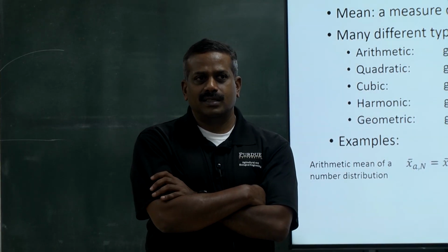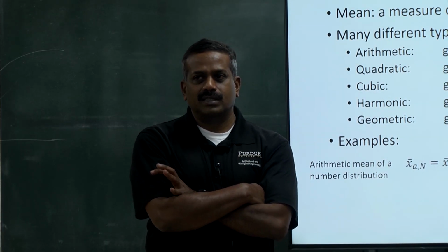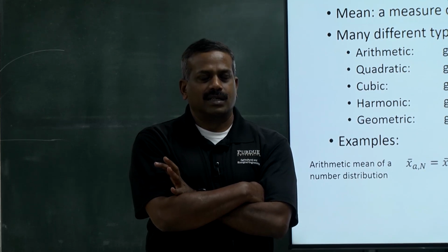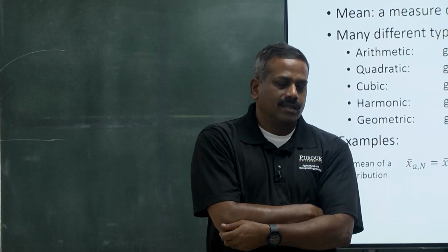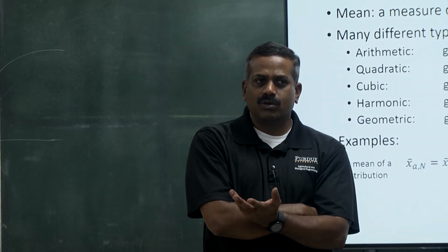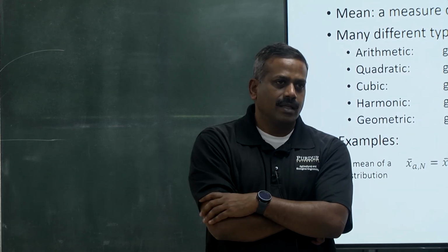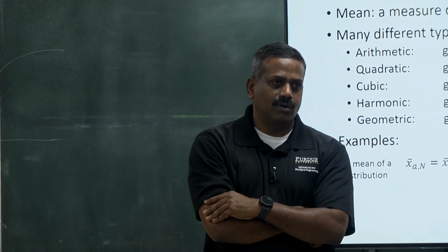Shear cell. Ring shear tester. Again, we will talk about that then, experimentally. There are different methods. Ring shear tester is very common. You might know the FT4 powder rheometer. Some of you might have heard. That's very common to measure the flow of powders.